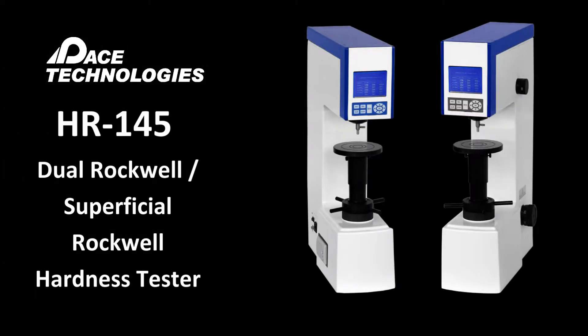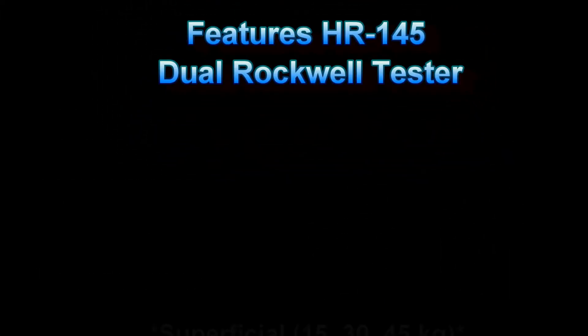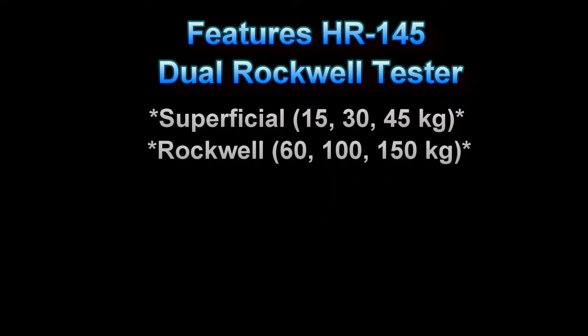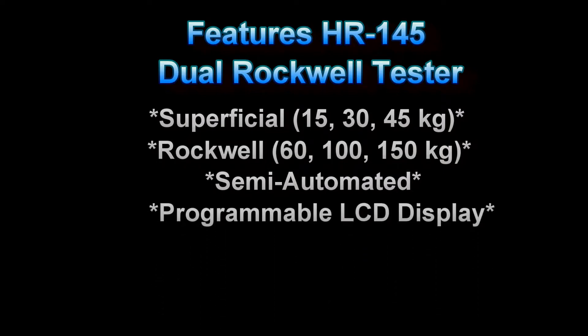The HR145 is a dual Rockwell and superficial Rockwell tester. The features include a superficial hardness range, the standard Rockwell hardness range, it is semi-automated, has a programmable LCD display, it is easy to use, and economical.